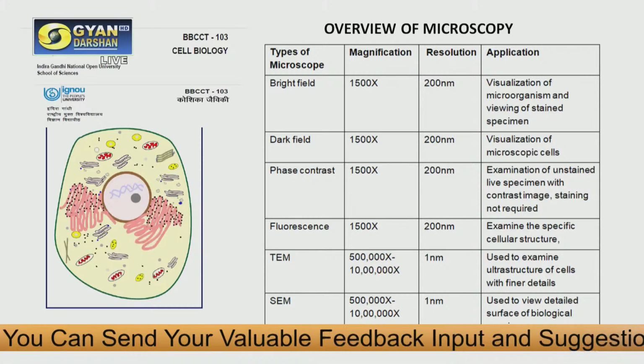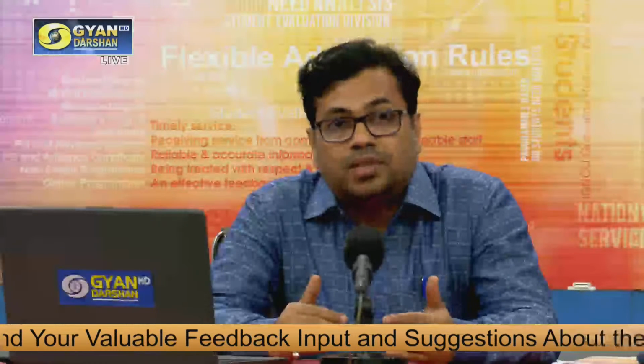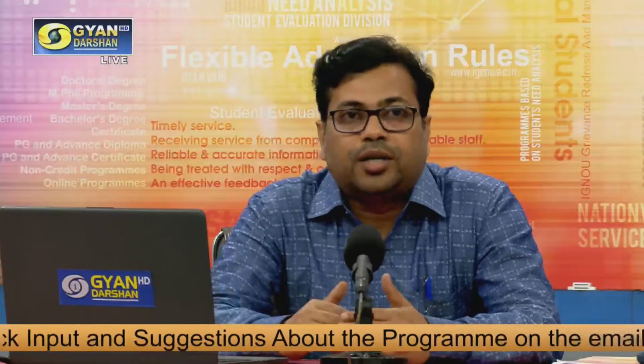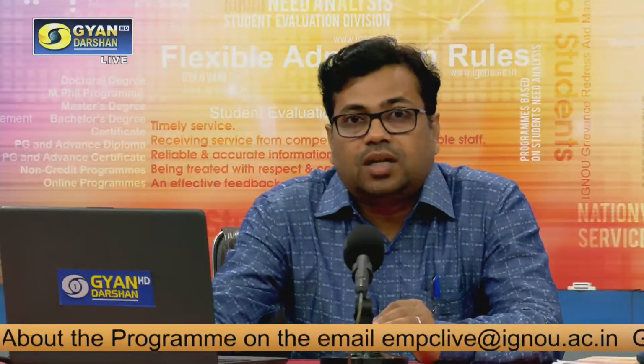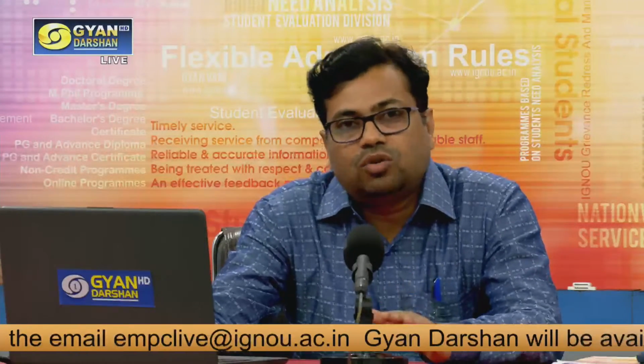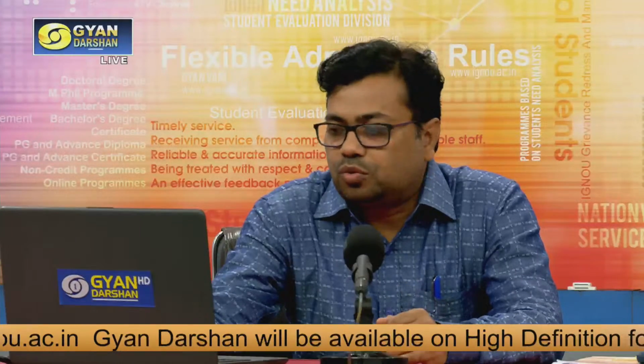It surpasses the resolution limit of light microscopy. So this is the overview of microscopy, and here we will discuss only electron microscopy, as in the previous session we already talked about the types and principle of light microscopy.